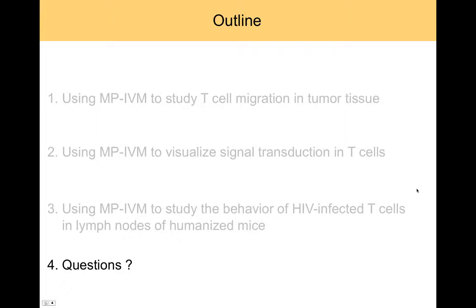Because from the time point that you make the decision until you get your first movies and your first useful actual data out of it, there's quite a bit of a learning period. So in my experience, it takes probably a year to a year and a half from the time point that you actually start to do these studies yourself until you really can produce reproducible data of interest.